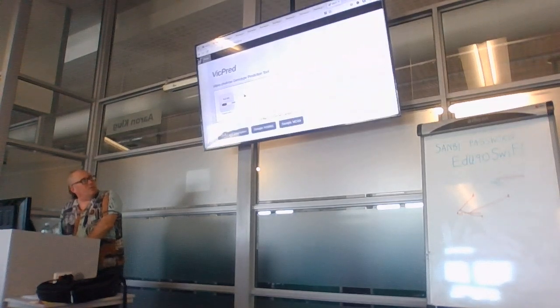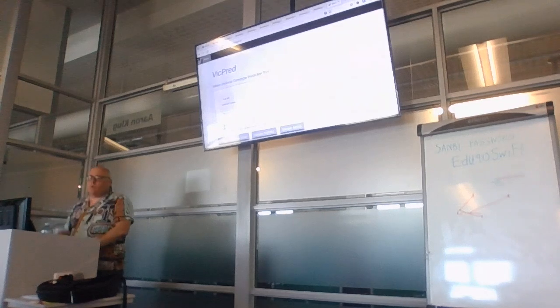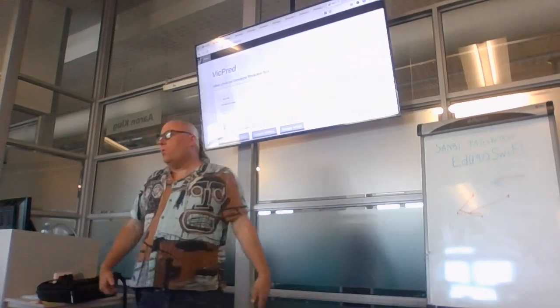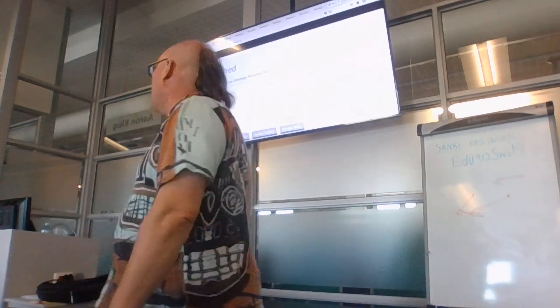And then if you do this, it uploads. You click submit. And after a while, you get a report on the O type and a whole lot more information about your sample.